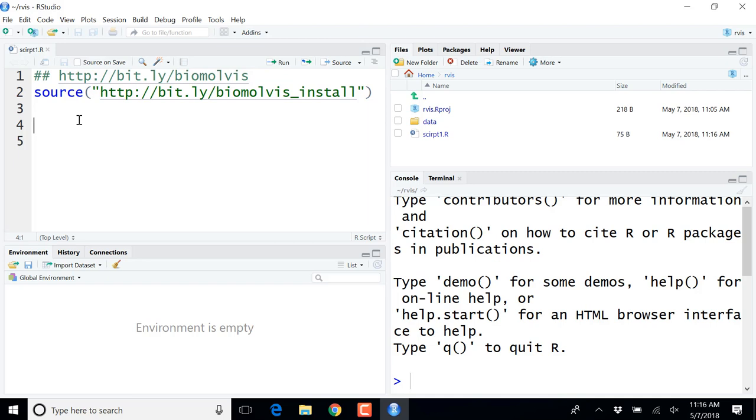That's a spiked-in experiment where a handful of proteins were spiked in a yeast background. For those that were here last week, this is the data set that we also used for the intro class. That's also the data set that Olga introduced. That's also a data set I think they use in the other room.